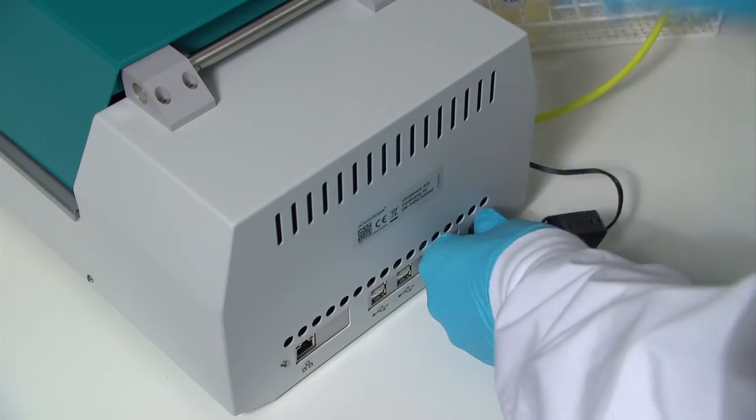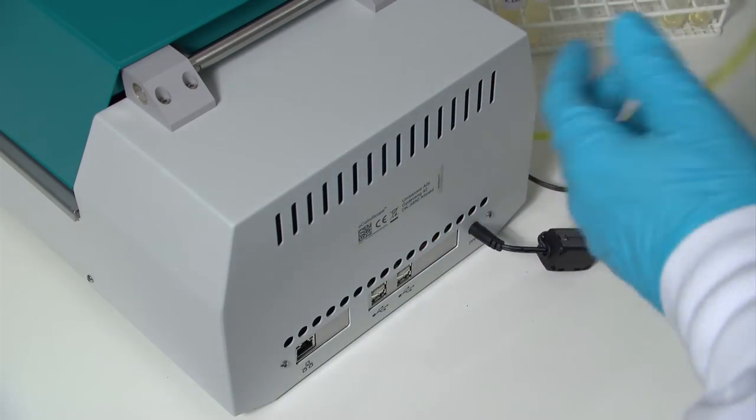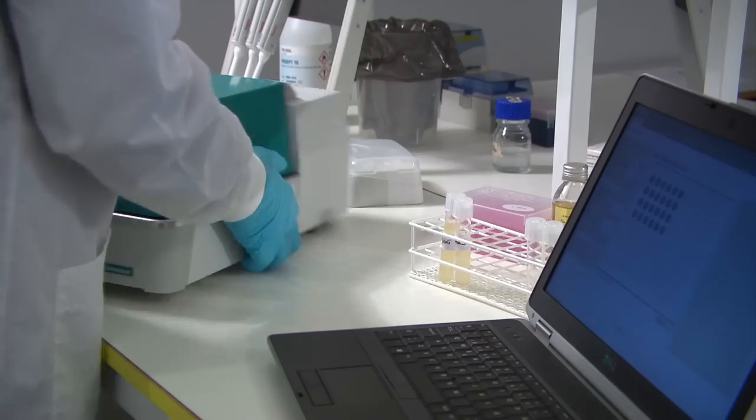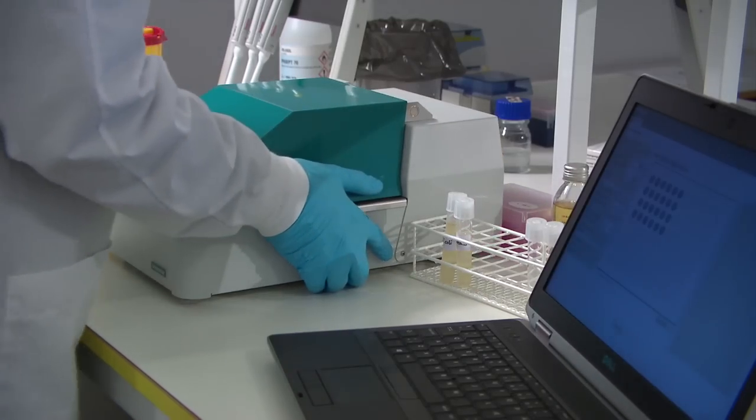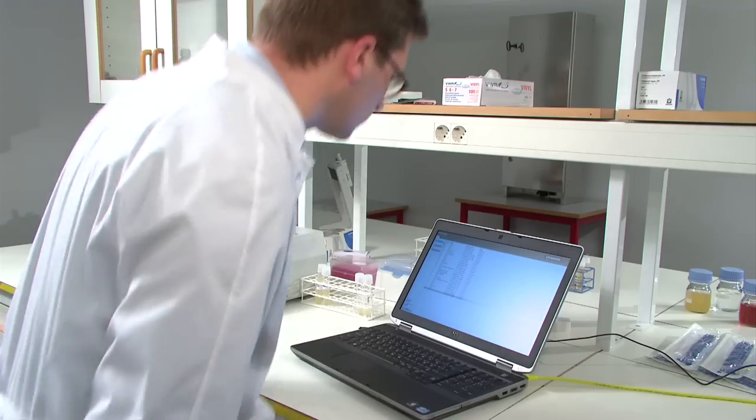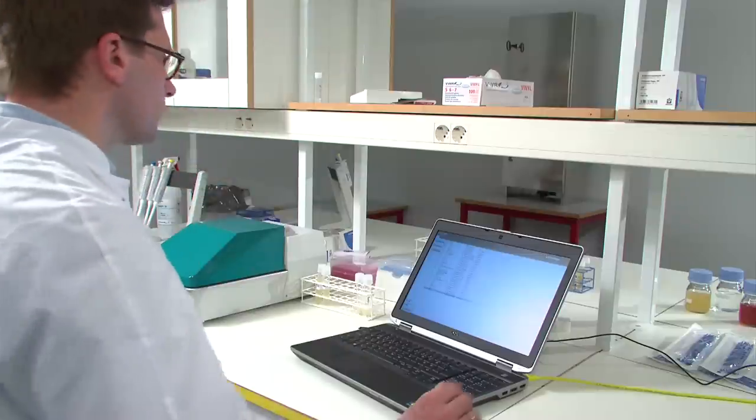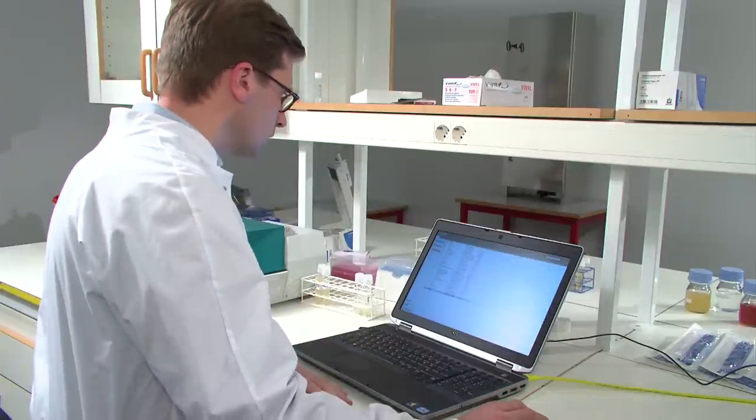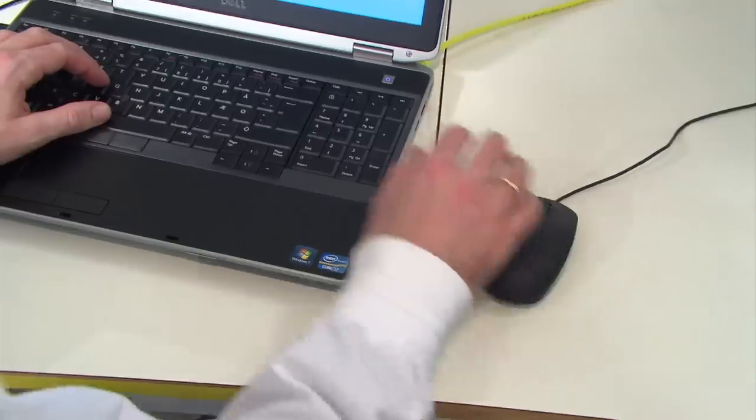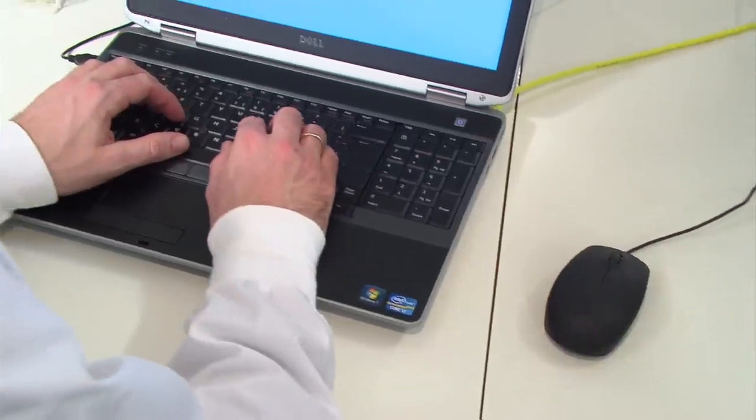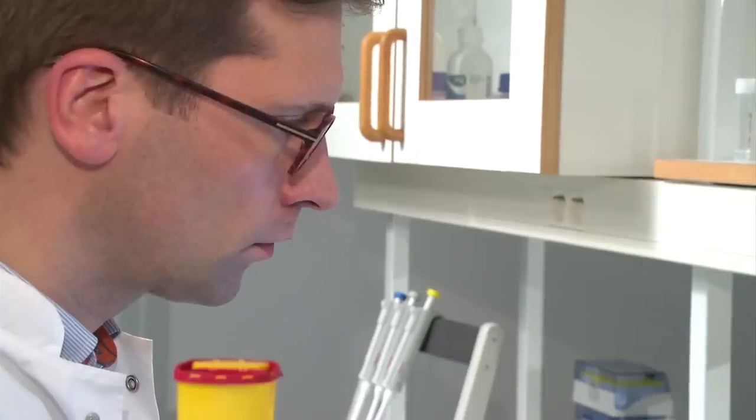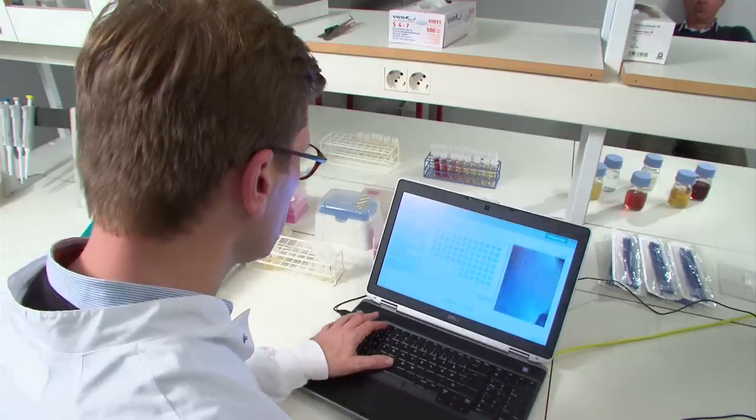This video shows how to use Ocelloscope to measure bacterial growth in a monoculture. Ocelloscope is run and monitored using a standard PC and only requires a normal network cable to connect Ocelloscope to the PC.